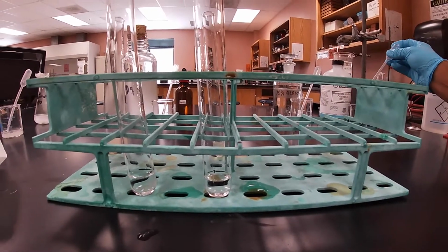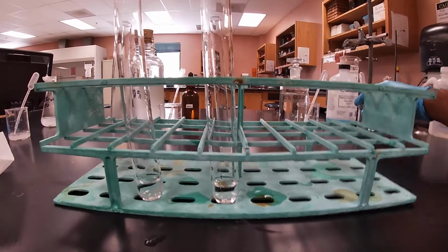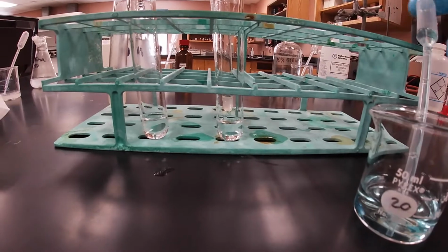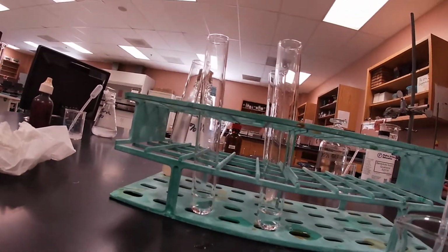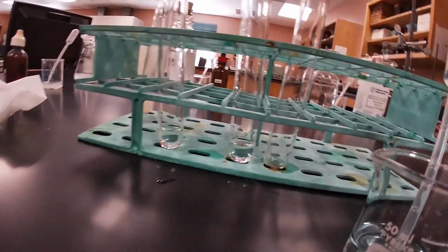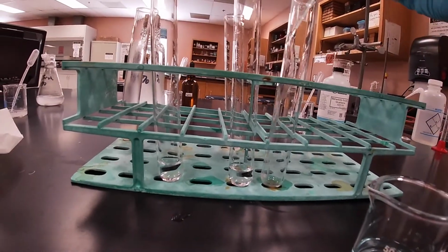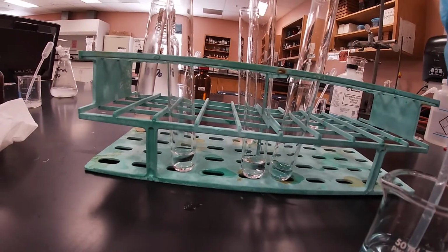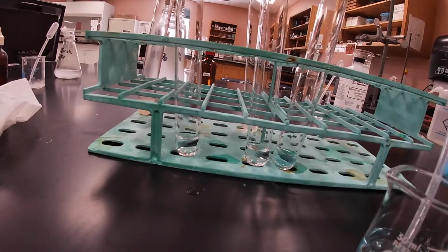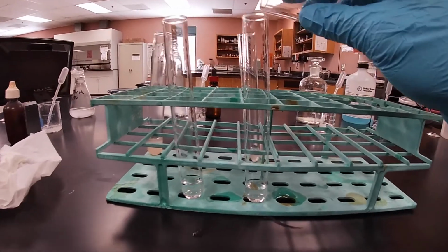Okay, so now we're gonna add approximately 3 milliliters of our Benedict solution to our test tube. And so let's go ahead and get another one. Here I'm gonna bring out another test tube. We're gonna add about 3 milliliters. And once we add our 3 milliliters, then we're gonna go ahead and transfer those 3 milliliters. So a little bit more. And that's about it. We're gonna go ahead now and add our Benedict solution into our glucose solution.